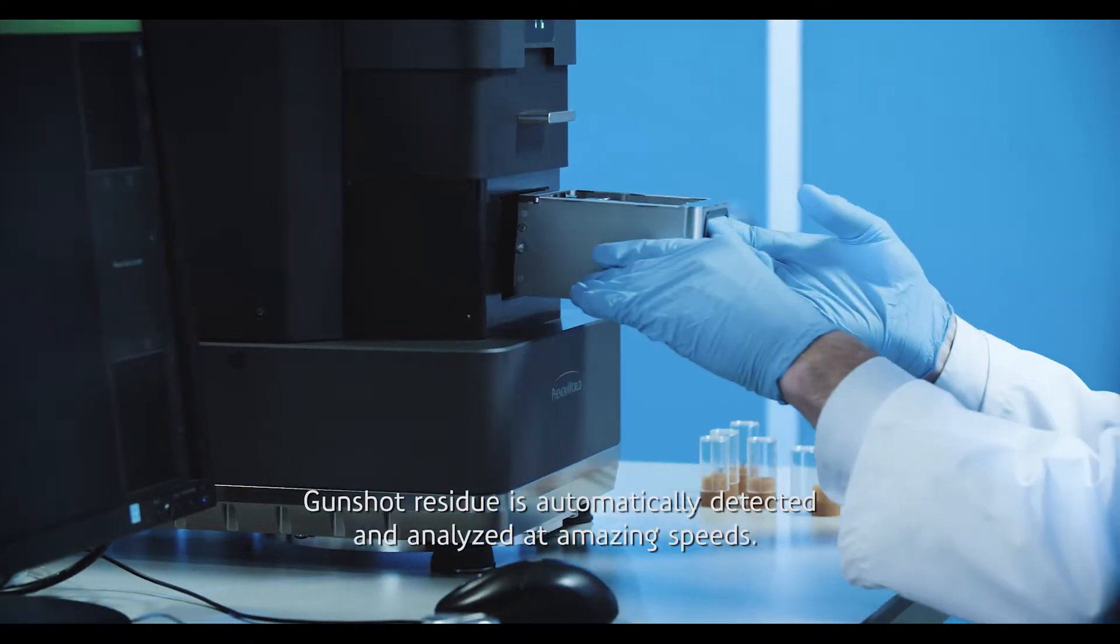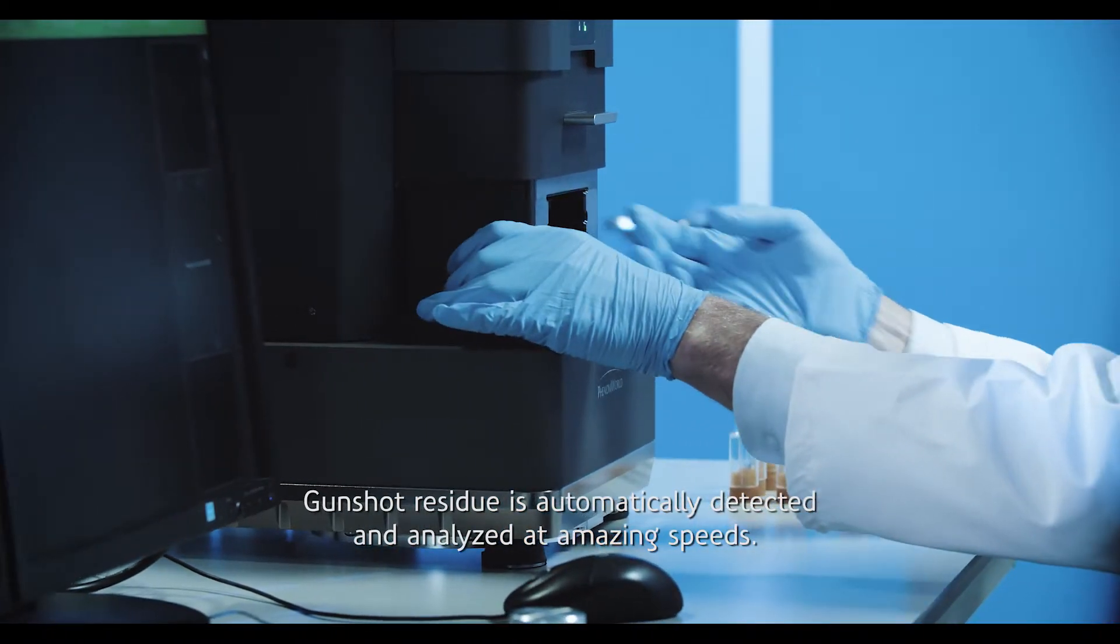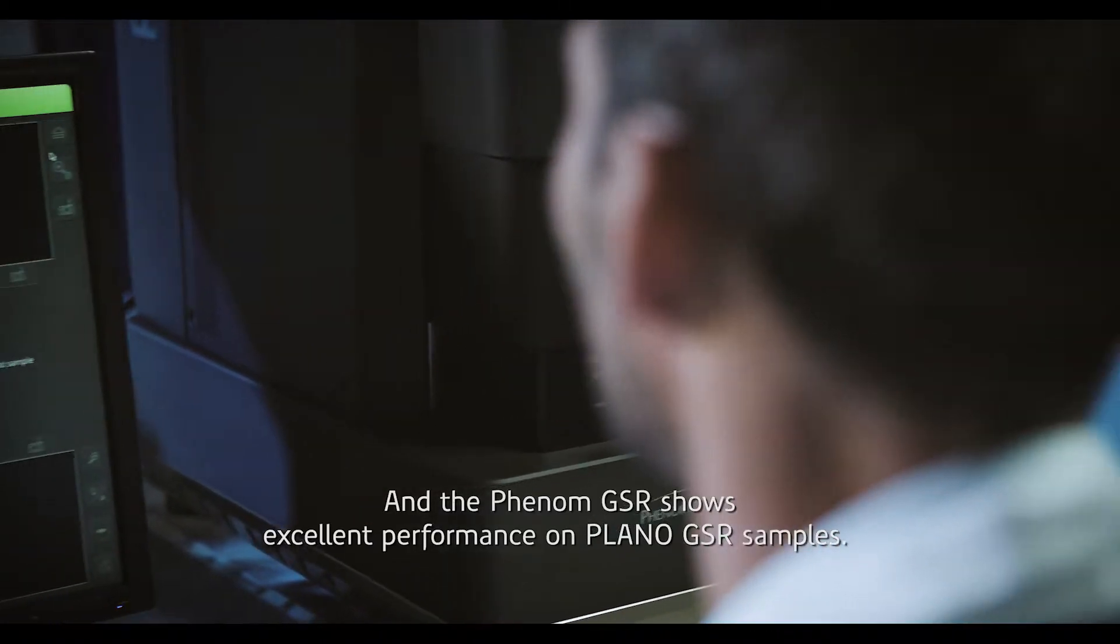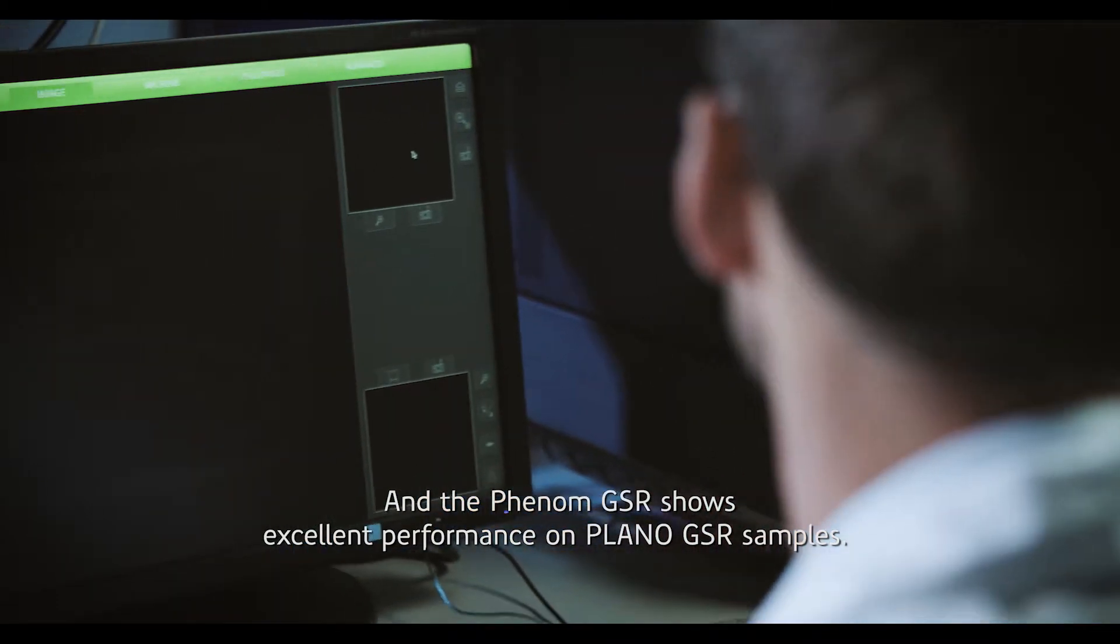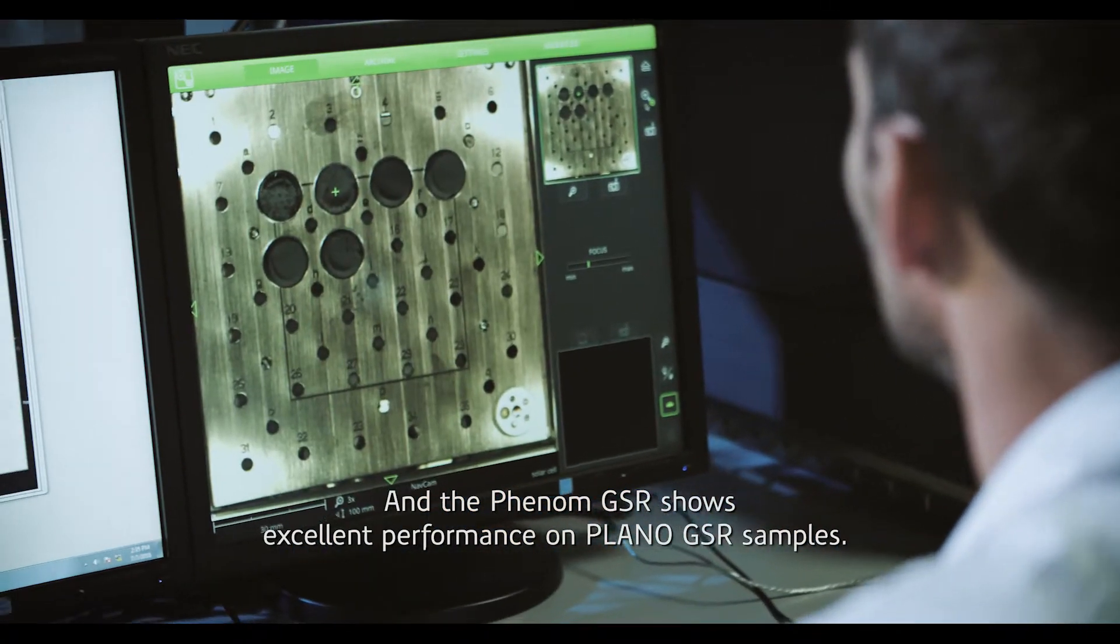Gunshot Residue is automatically detected and analyzed at amazing speeds. And the Phenom GSR shows excellent performance on Plano GSR samples.